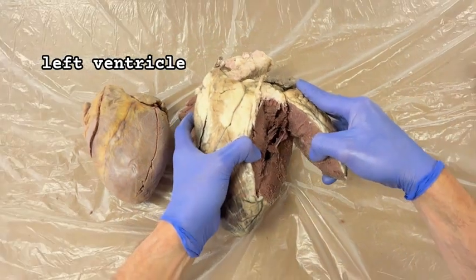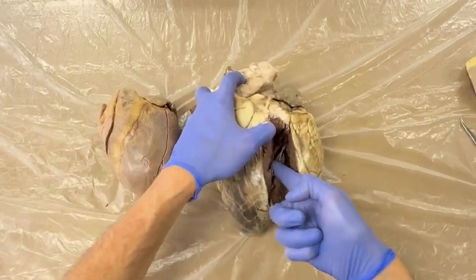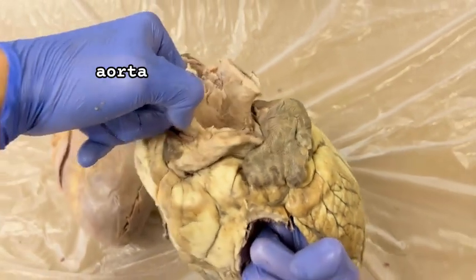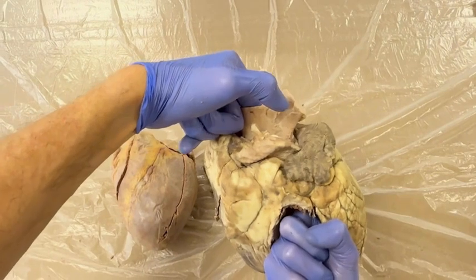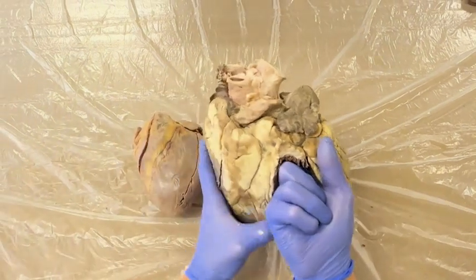Part of this has to be cut away to show the cavity of the left ventricle. Blood is then pumped out the left ventricle into the aorta. It's such a long distance that I can't put my finger all the way through, but my fingertips are touching, showing blood flow from the left ventricle to the aorta.